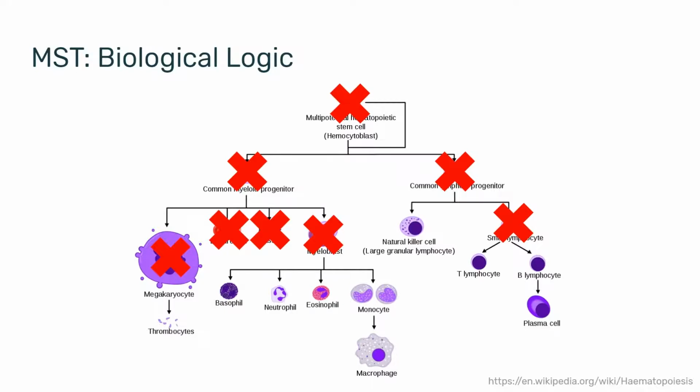That is by design. And there are tissue-specific cells, such as microglia in the brain. So this is one way in which this breaks. A second way in which the analogy breaks, and this is relevant in the context of panel-based assays such as mass and flow cytometry, is that your panel might not have the markers that you need to identify the intermediates properly. And your panel might not have the markers you need to identify a given subset at all. So it's possible that your panel doesn't have any markers for T cells, and yet your sample might have T cells, and that might interfere with the logic that goes into the minimum spanning tree.